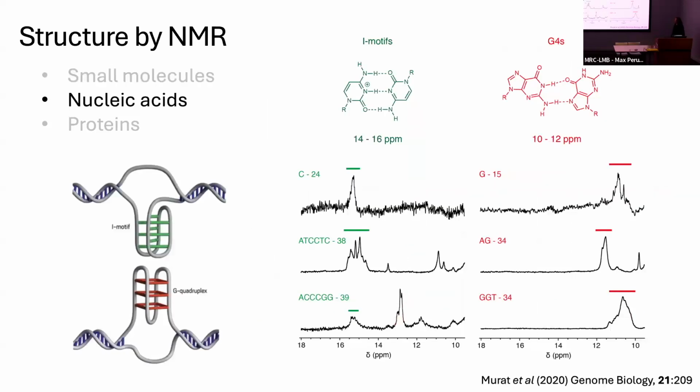You might not know that NMR spectroscopy is probably one of the most accurate techniques for identifying non-Watson-Crick, non-B DNA secondary structure elements in DNA, for example i-motifs and G-quadruplexes. This is worked on in the Sale lab, because these base pair hydrogen bonds have unique chemical shifts in the proton dimension, which means you can identify these secondary structure elements.